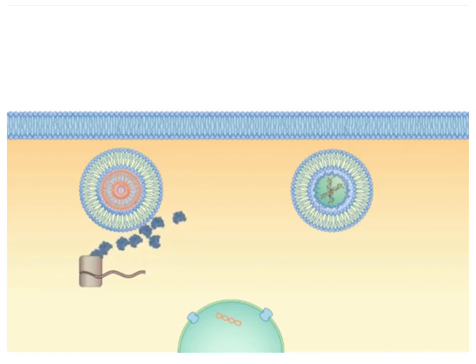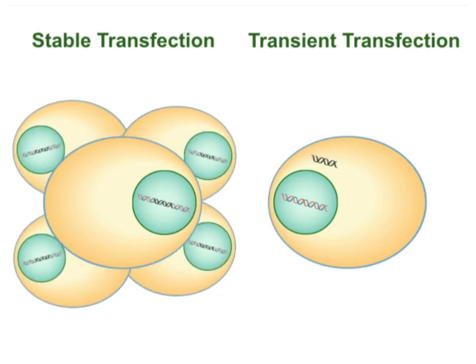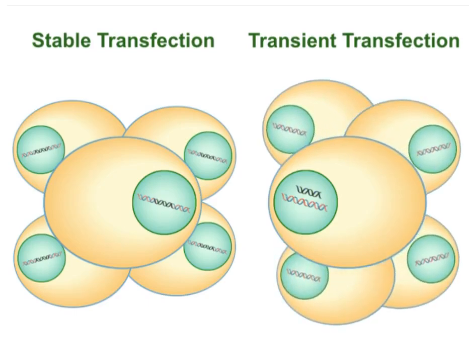The cytoplasm is the site of action for the small interfering RNA, or siRNA, where it reduces the production of protein by interfering with a part of the cell's protein-producing machinery. Transfected DNA can exist either stably or transiently. Stable transfections occur when transfected DNA is introduced into the genome and therefore persists as the cell divides. Transient transfections occur when the DNA is not incorporated into the genome and expression of the coded protein is lost during a span of about 24 to 96 hours.